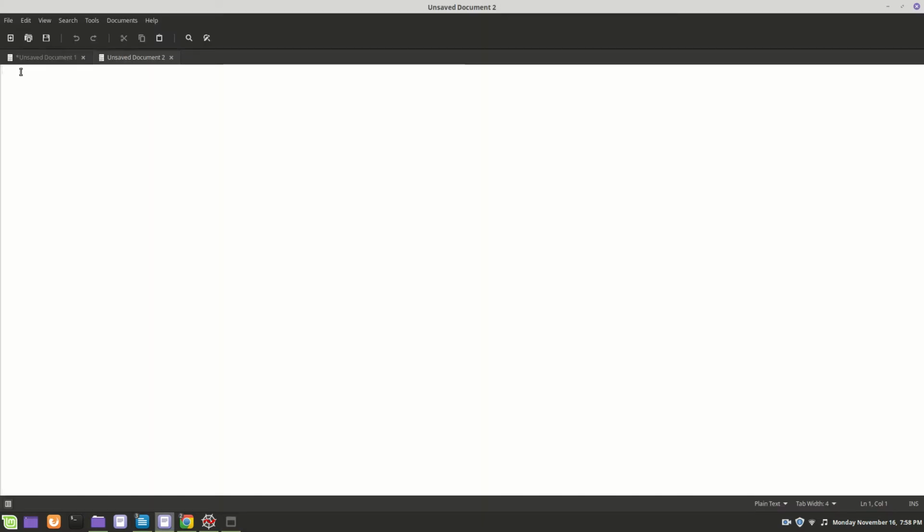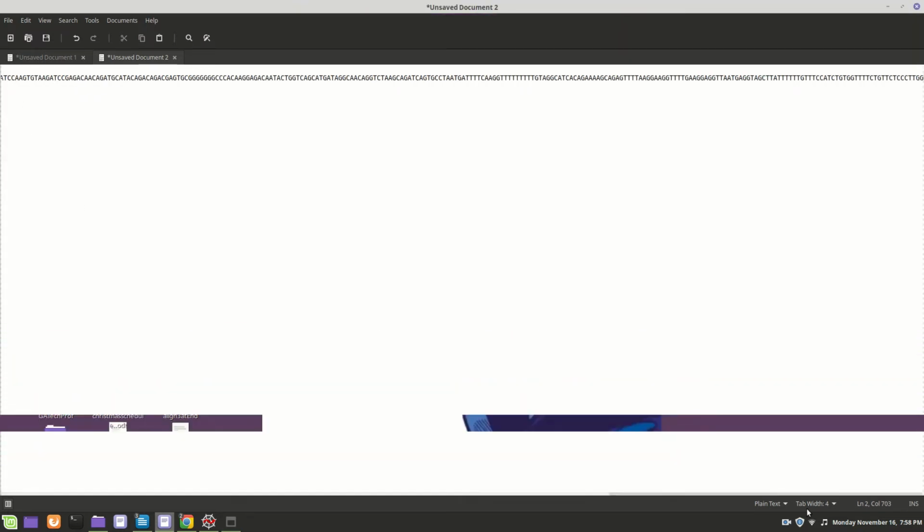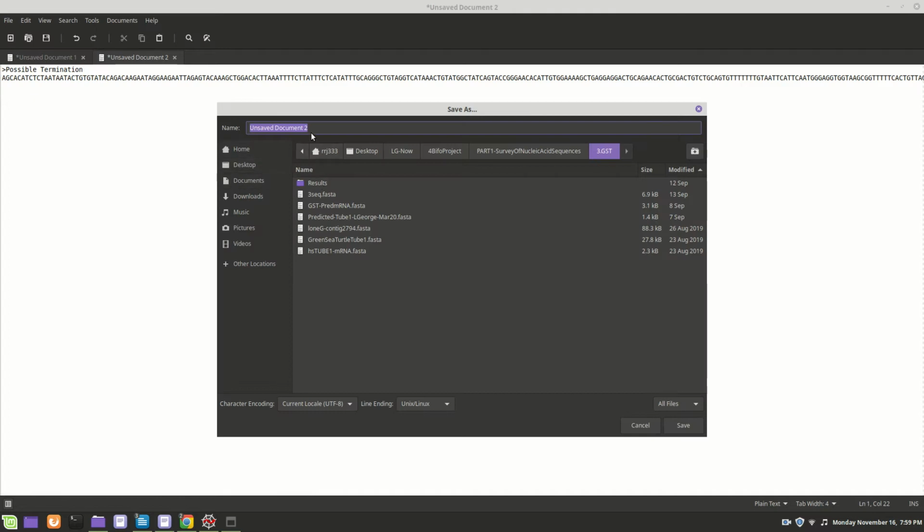Let's see, and let's place this here. All right, and let's name this something like possible termination. And I'll save it as the same.